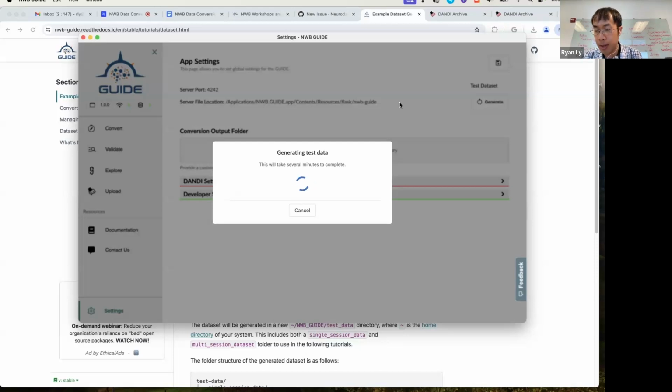This will generate, I think, a minute or two of fake Neuropixels data, and then do a rough spike sorting of that data and processing to get that into the Phy format. And we will be converting that data, the SpikeGLX data and the Phy data, to NWB.